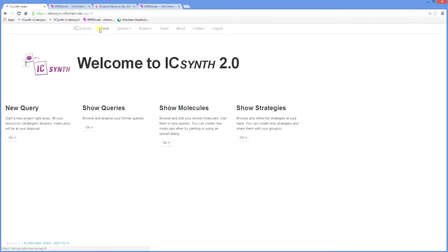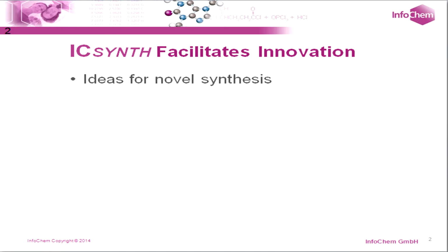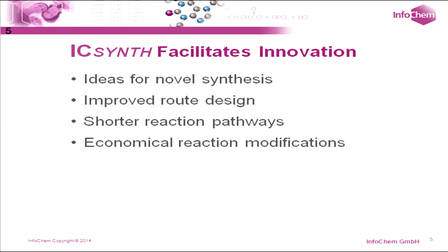Thus, Infochem's icsynth can facilitate innovation by stimulating ideas for alternative or novel synthetic routes that otherwise may not have been considered. The benefits may include improved route design, shorter pathways, or more economical reaction modifications.